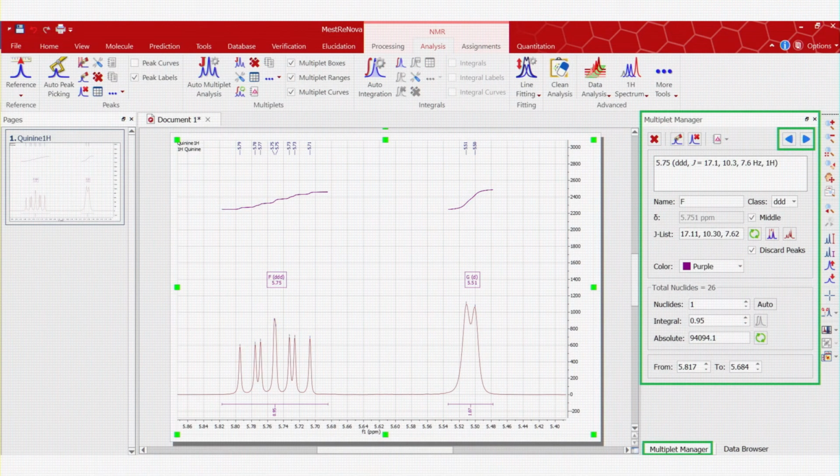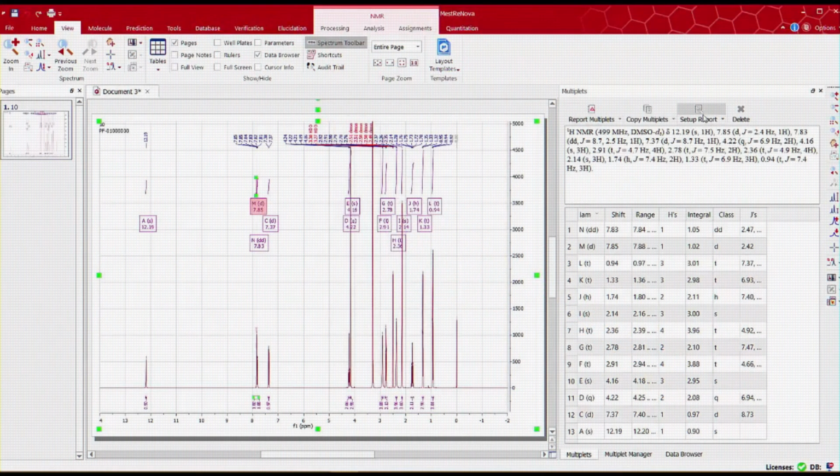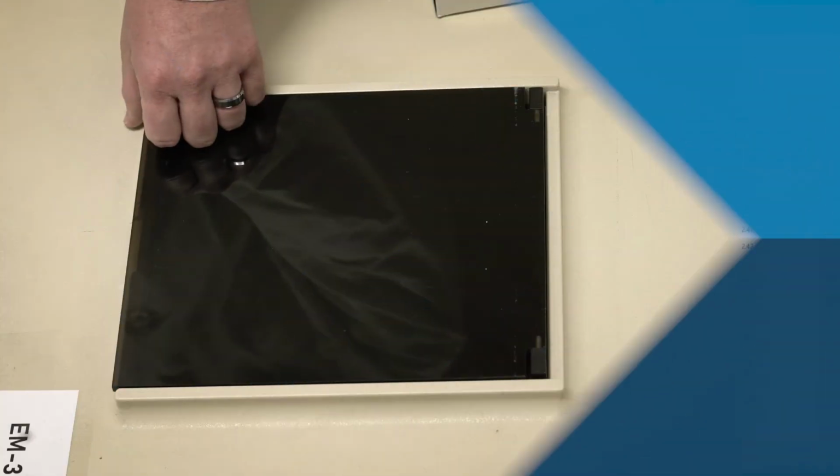This is what an NMR spectrum looks like. Normally, we use the MNOVA software to analyze NMR spectrum. The different peaks in the spectrum correspond to different hydrogen atoms in your sample. You will learn more about how to interpret NMR spectra in your organic and spectroscopy courses.